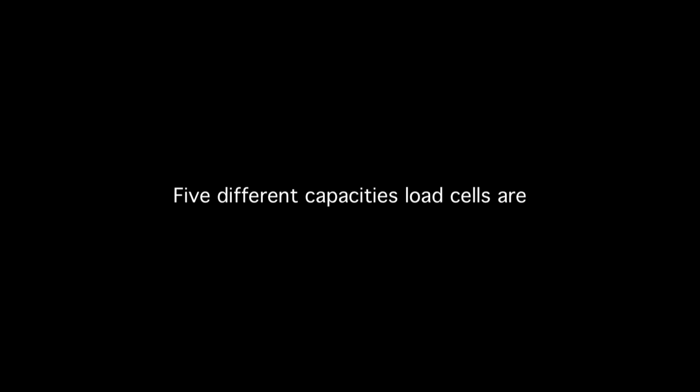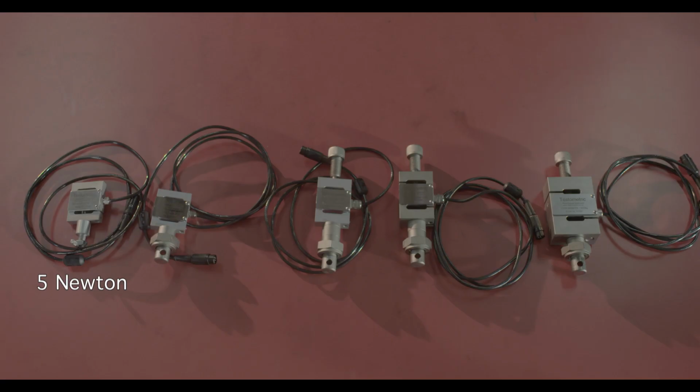Different instrument attachments available. Load cells. Load cells with different capacities are available with this instrument. Minimum capacity is 5 newton and maximum capacity is 30 kilonewton. Five different capacities of load cells are available: 5 newton, 100 newton, 1 kilonewton, 5 kilonewton, 30 kilonewton.